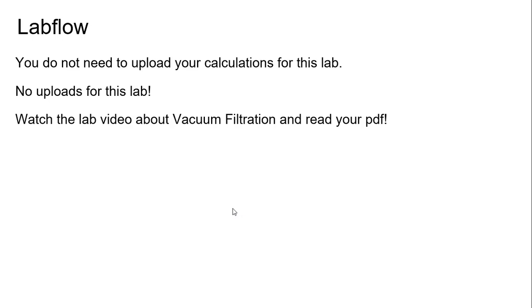I don't think chemistry has to be any more difficult than it already is, and I don't like this lab. I think it could have been done better. So I'm going to give it to you the way that I do in my lab. So no uploads. Ignore the uploads. Don't panic. I'm not taking uploads for this. I'm telling you right now. That's it. This is a very easy lab. I know it seems more complicated, but I've removed a lot of that stuff.